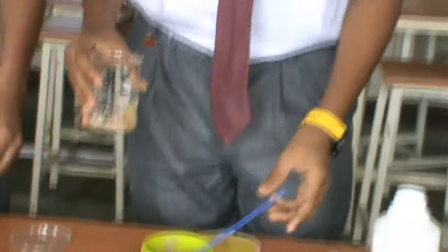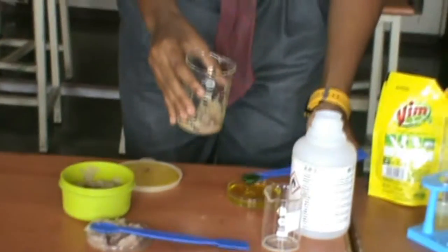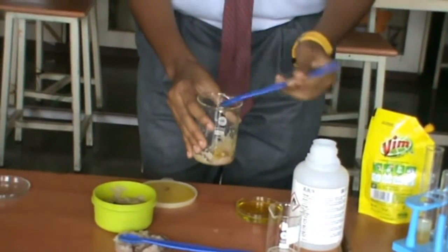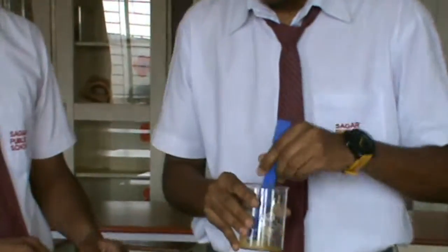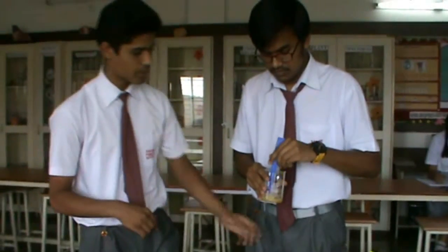And then we will add some dishwasher into it. Now after adding the dishwasher into the beaker with the paste, we will stir it very nicely so that all the bubbles disappear from it.